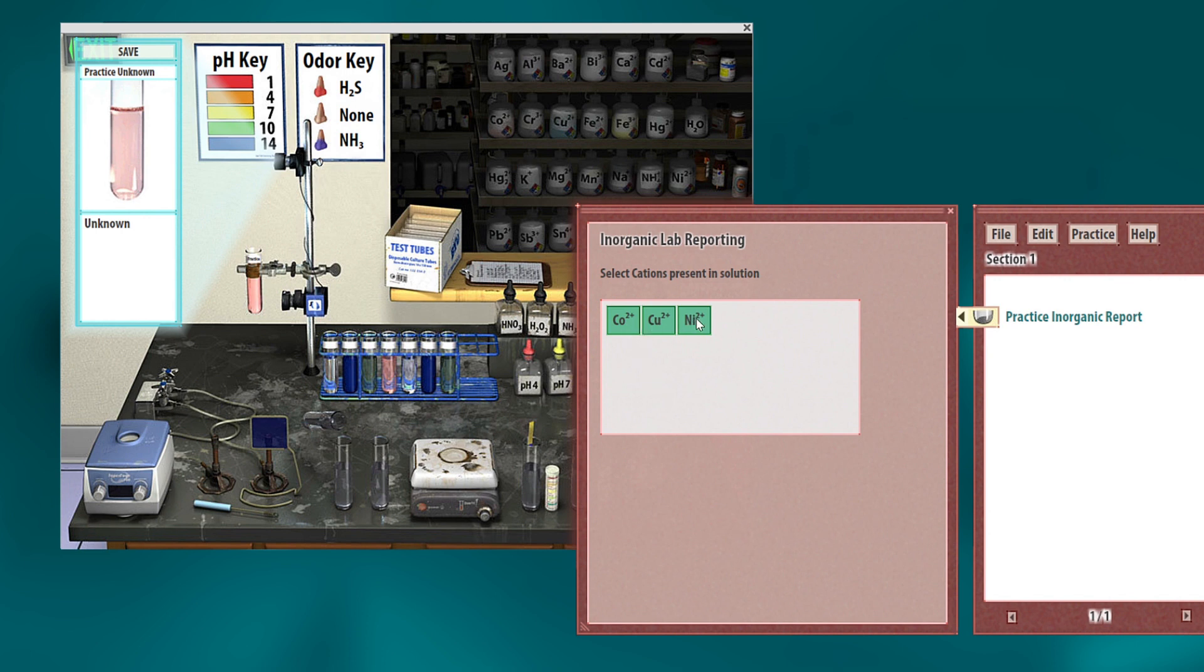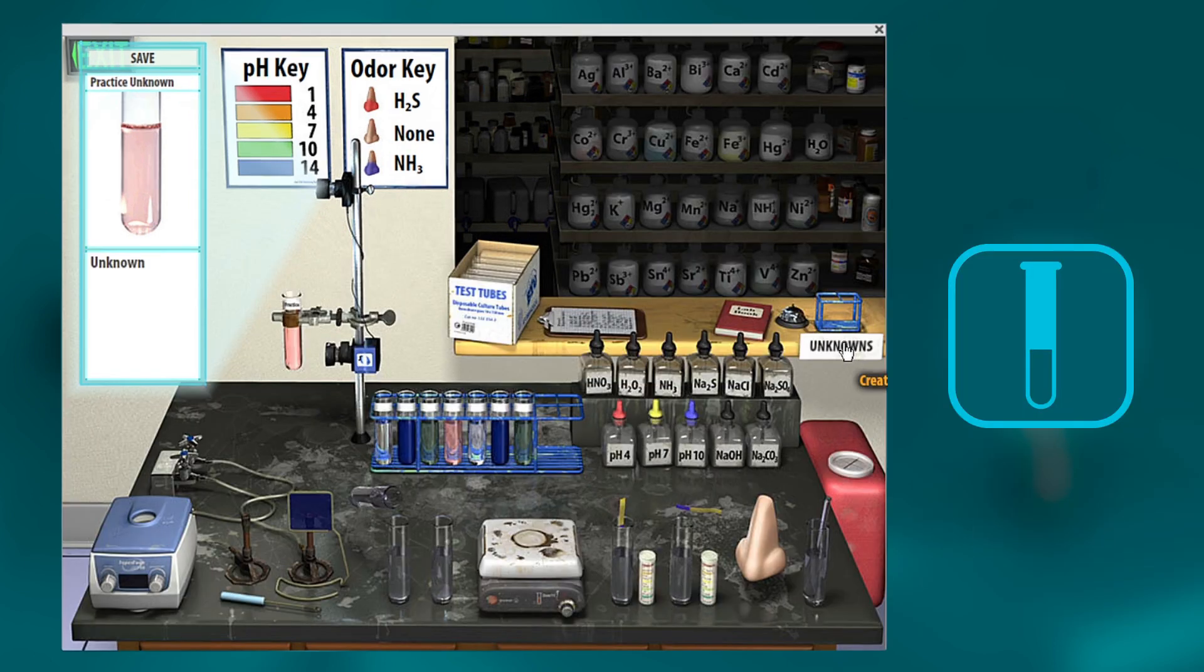And since all buttons turn green, it means you did the test right. You got it right. If you're still not confident, go back in, create another new unknown. Keep testing it as many times as you need. So then when you go into the real lab to do more qual analysis, you're ready.